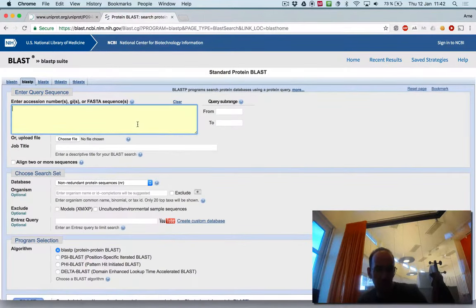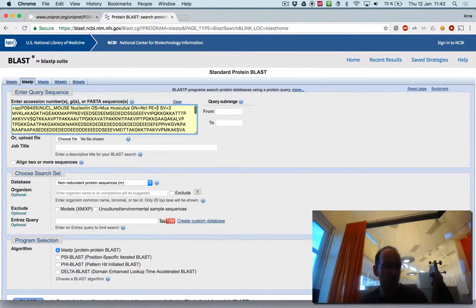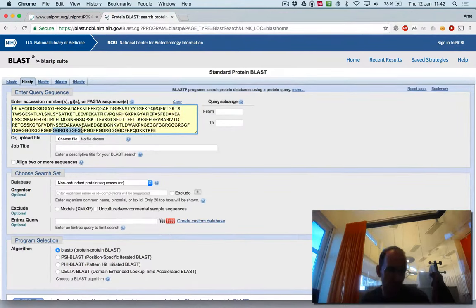You can put in your sequence here. This is the sequence that was the one we used on the web, P0905. You can see that it actually contains a number of low-complexity regions. You have a lot of GGR, GGR here for instance at the end.